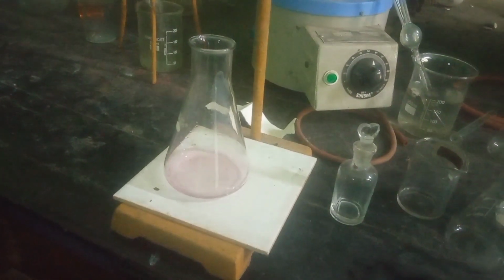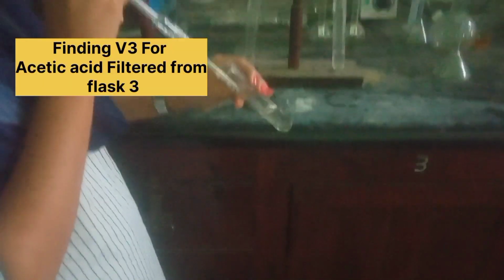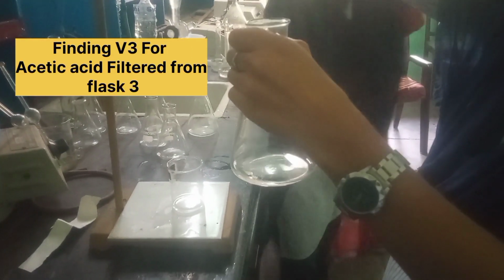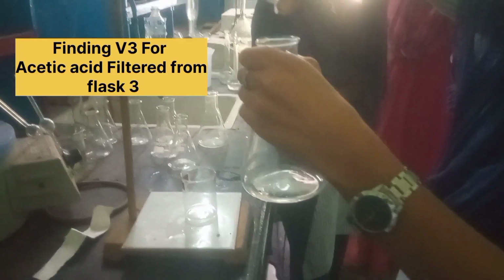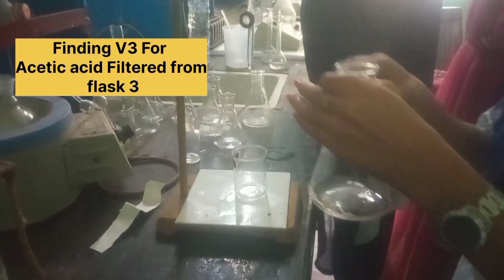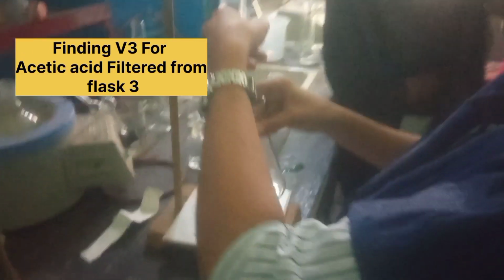So after getting the values of Vi, V1, V2, V3, V4, V5, that means after getting the volume of NaOH required to neutralize acetic acid, by means of that we can calculate the concentration of acetic acid.